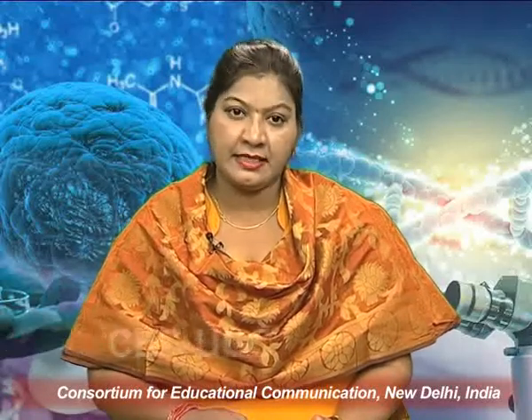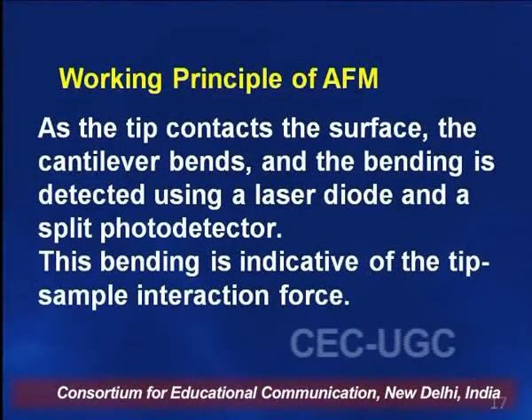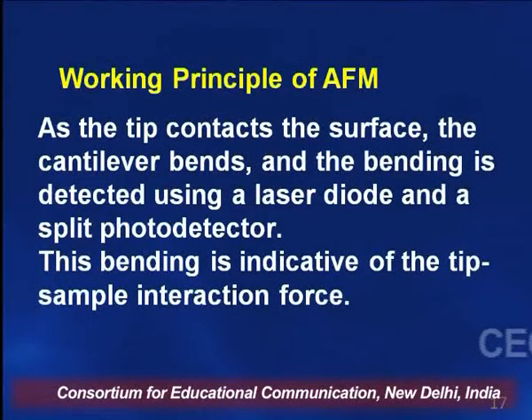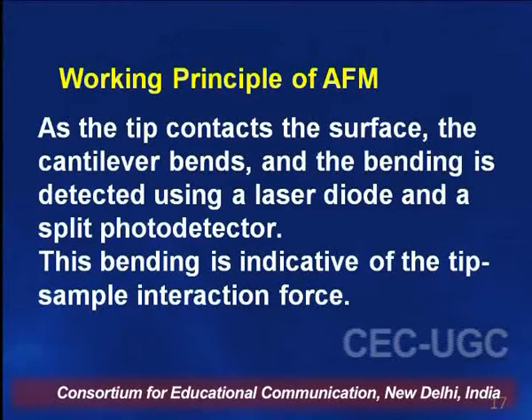So this cantilever is used to make the tip act as a spring, and as the tip contacts the surface, the cantilever bends, and the bending is detected using a laser diode. It means we use a laser beam on the cantilever. The cantilever gets the force and bends on the surface, and a split photodetector detects it.